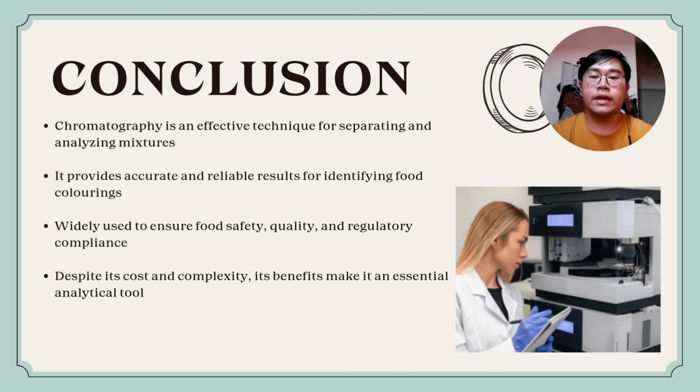We also looked at example results to understand how chromatograms are interpreted, explored the advantages and disadvantages of the technique, learned about the different types of chromatography, and discussed its real-life applications, particularly in the food coloring industry. Overall, chromatography is a highly effective analytical technique that plays a vital role in ensuring food safety, quality, and consistency.